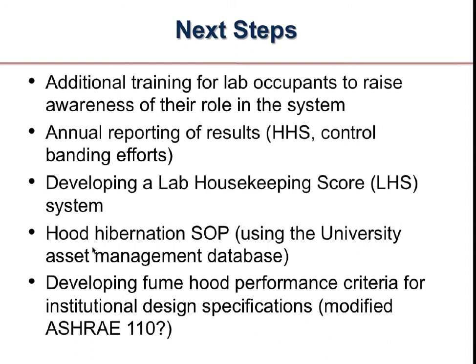This way, we're keeping up with the technology that is coming out. I'm sure many of you have noticed over the last 5 years, there's more hoods. There's a lot of competition for fume hoods that operate at very low volumes. And so the performance criteria, I think, is something that I would like to see for our purposes, whether the ASHRAE 110 actually gets revised or not. But I would like it to align with some of the other design specs that are out there.